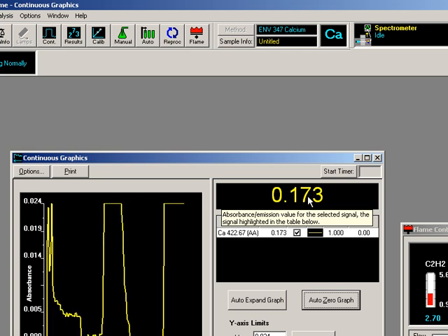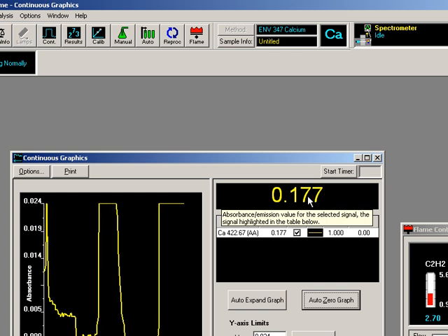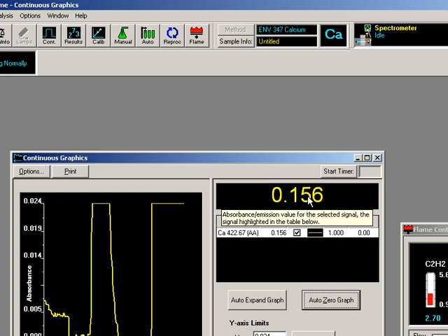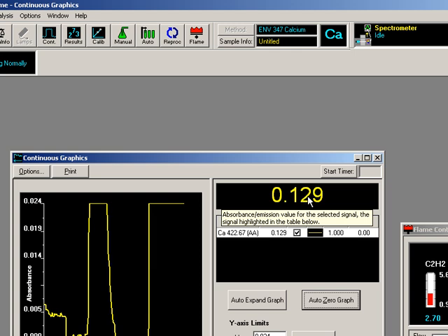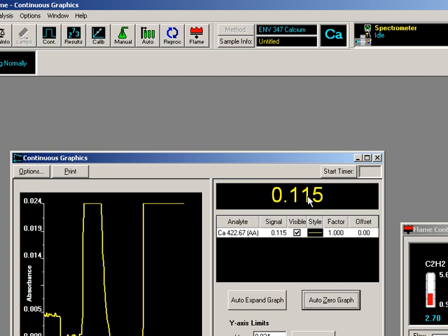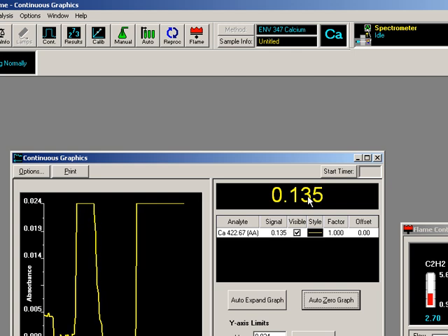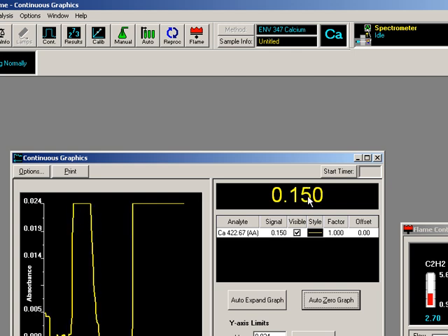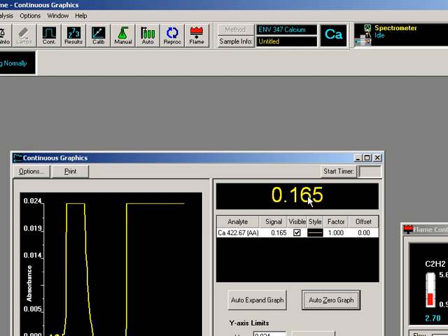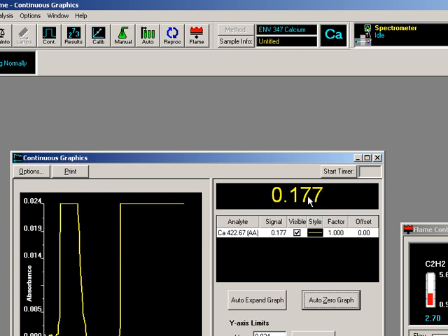So I'm going to move the in and out control that moves it on an XY plane, not up and down. And as I do that, I was at 0.177, so we'll just go in one direction. And you can see it go down then to 0.127, etc. So we'll turn the opposite direction. Very slowly rotate the knob. And the knob I'm adjusting is right below the burner head. So now we're just about back up, and we'll just keep on going.